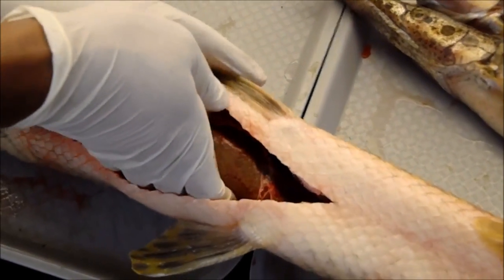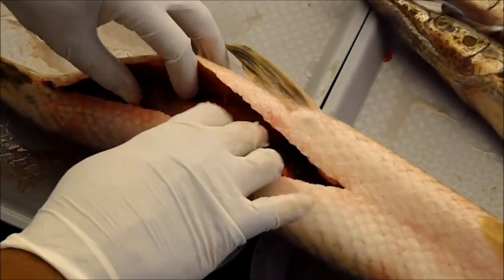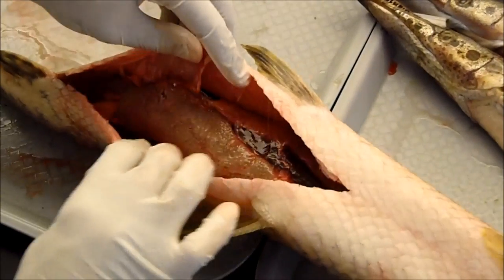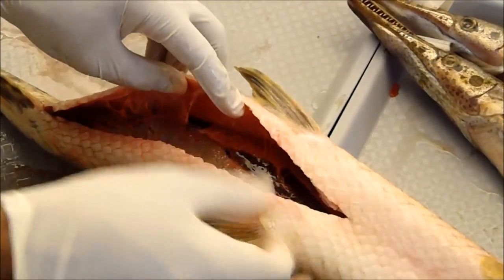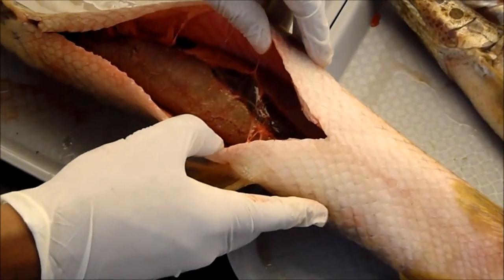The female gamete release pathway would look like a solid connection, as opposed to a very threaded connection in males. Here you can see very obvious immature eggs, which indicates that this is a female.